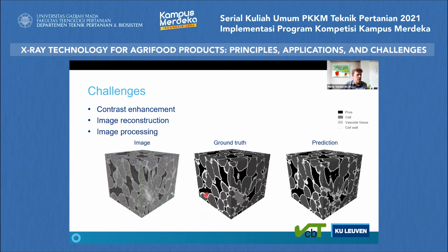And then finally, we haven't talked too much about how we do this image processing. You have these images, grayscale images with air pores, there's noise in them and so on. Bayu can tell you that it is a lot of effort to get information from this image for your modeling, to create appropriate models and so on.